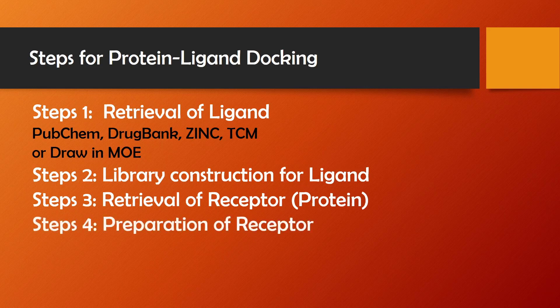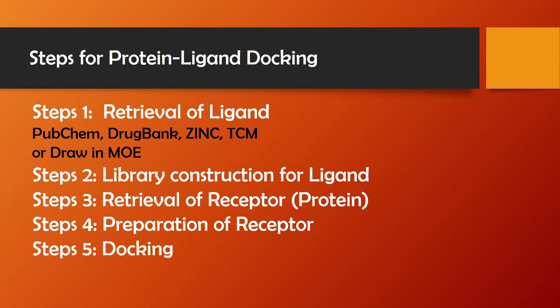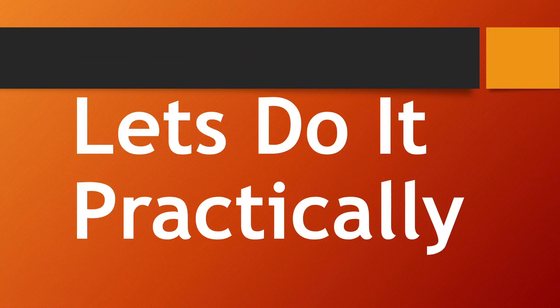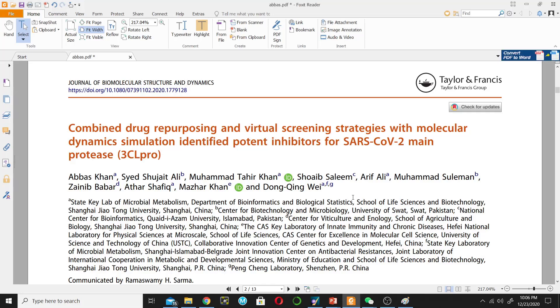Step 4 is the preparation of the receptor. Sometimes when we retrieve the receptor protein it may have missing residues or missing atoms, so we need to prepare it before docking. We will also minimize the energy of this protein before docking — all of this comes under preparation of the receptor. Step 5 is the docking itself, and Step 6 is the docking analysis. Let's do it.